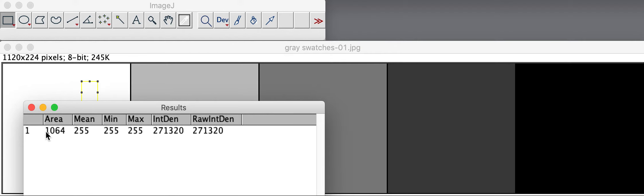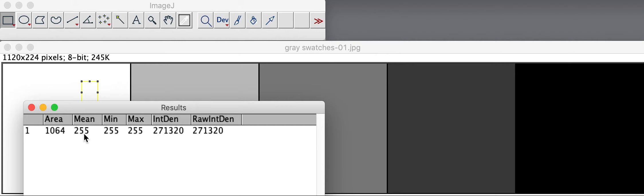The area in pixels, the mean, minimum, and maximum brightness. In this case white is a measurement of 255. Black is 0. So brightness is measured on a scale from 0 to 255.